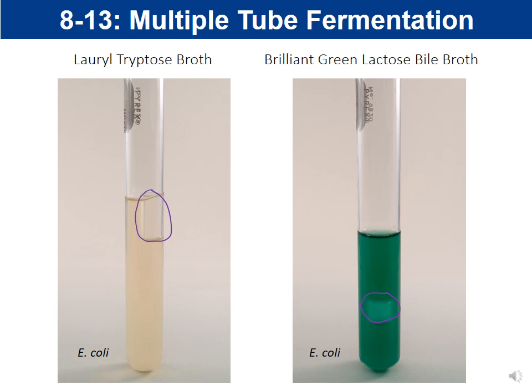And so if you see this, this would be confirmatory that in fact the water sample does include a coliform because we do see the acids in the endo agar and the gas in the multiple tube fermentation. And so putting all this together would allow you to see if the water sample you're testing, whether it be your refrigerator or bottled water or whatever sample you're testing, all of these tests combined would tell you if there are coliforms in that water sample.